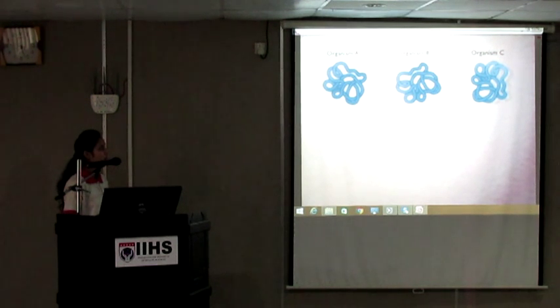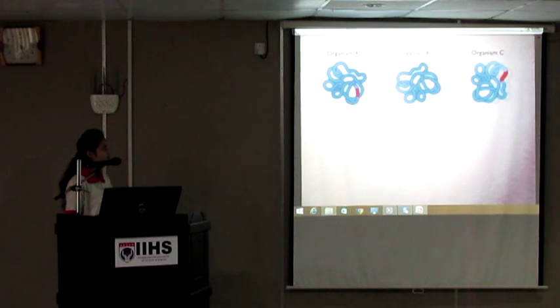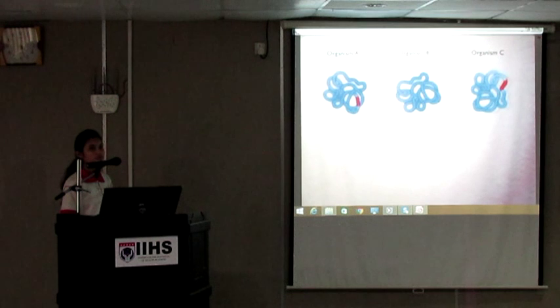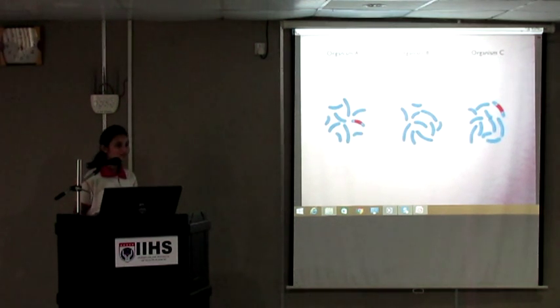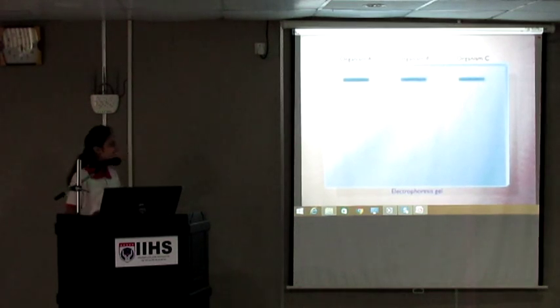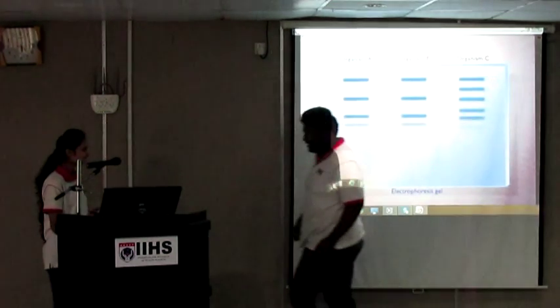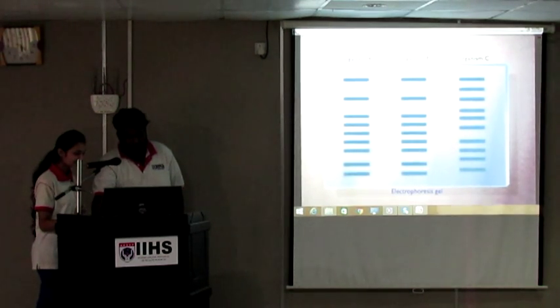The Southern blot is used to verify the presence or absence of a specific nucleotide sequence in the DNA from different sources and to identify the size of the restriction fragment that contains the sequence. In this procedure, the DNA is isolated from each source and then digested with a specific restriction enzyme. The DNA restriction fragments are then loaded onto an agarose gel and separated by electrophoresis according to size, with the smaller fragments migrating faster.